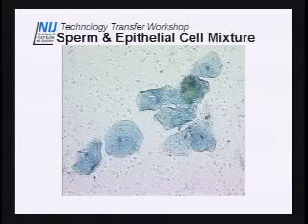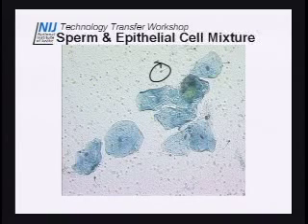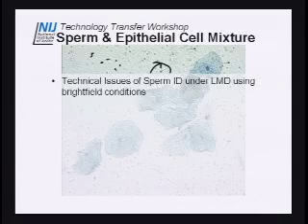Again, this is what you'd see under the microscope on the computer screen. You've got sperm cells here, and obviously you can see the big epithelial cells. So there's a couple technical issues of sperm ID. Kelly mentioned some of them, using LMD, especially under just bright field conditions. She talked about the pores in the pen film. So you see all these little pores, and it's kind of this architecture that's in the film. And that's actually the biggest obstacle.